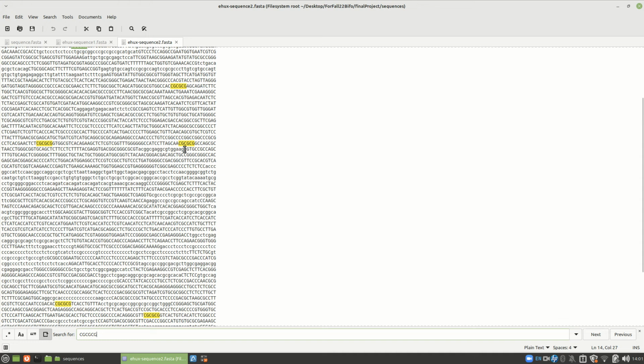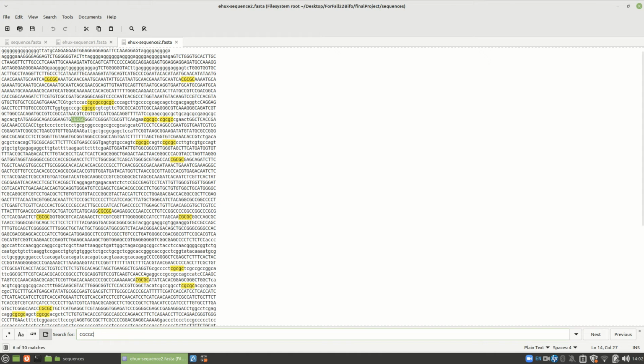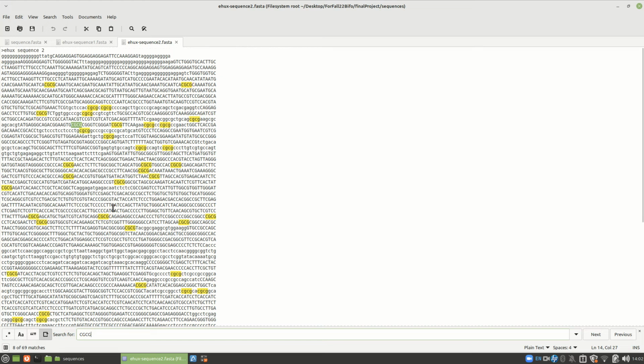Now realize, if you know that this is the region you want, the CpG island can go into the first exon. So let's reduce this a little bit and just do it that way. Yeah, that's looking good. So when we do this, it's right here between these. And if I reduce that, you see, yeah, that's probably your CpG island. This is probably your first exon, if you can see in here. And your gene is here.